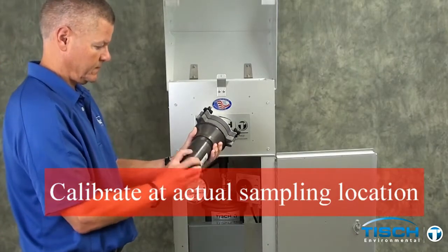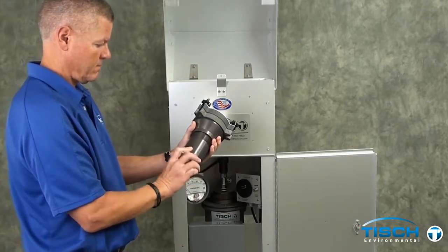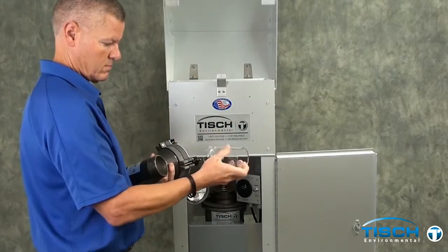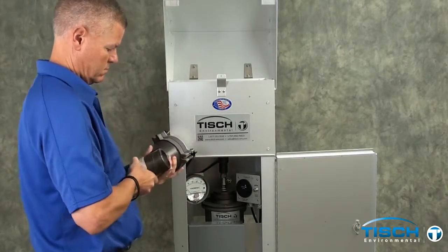This is the calibration of a TE-1000 PUF air sampler. You start with the module, which is the TE-1002, and you want to make sure you have an empty piece of glass in there — no foam, no XAD.